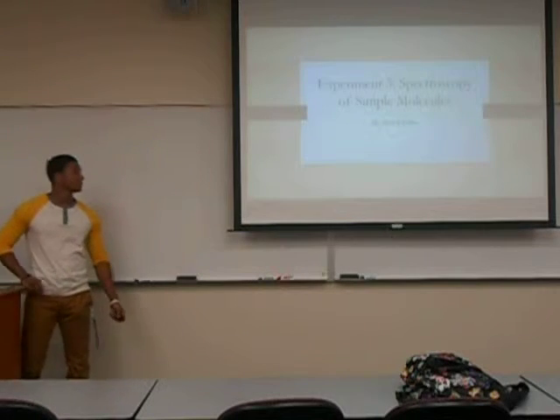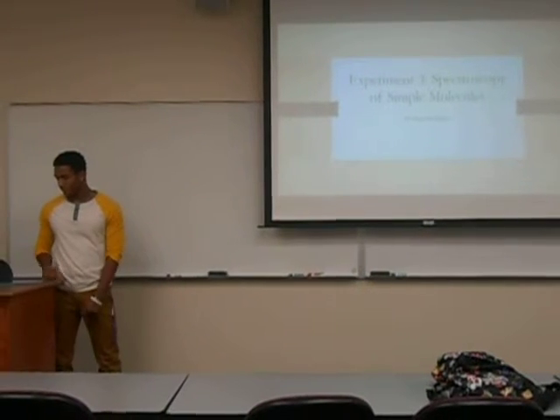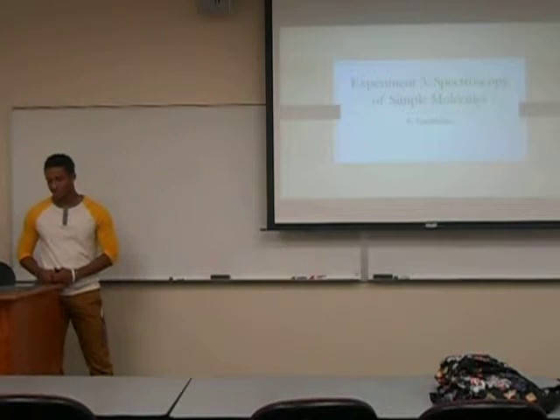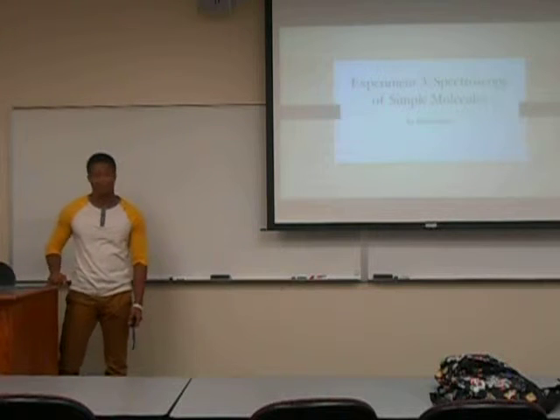Okay, my name is Daryl Sullins, and today I'll be talking about Experiment 3, spectroscopy of simple molecules. The purpose of this lab was to determine the unknown by searching the similar functional groups, number of peaks in a compound, and the ratio to area.